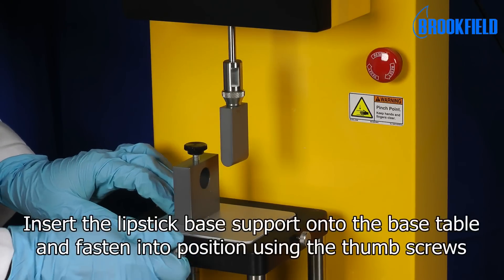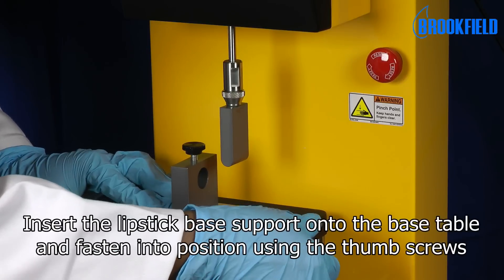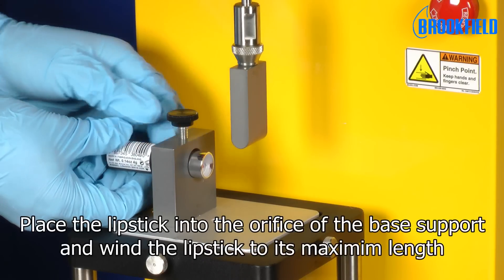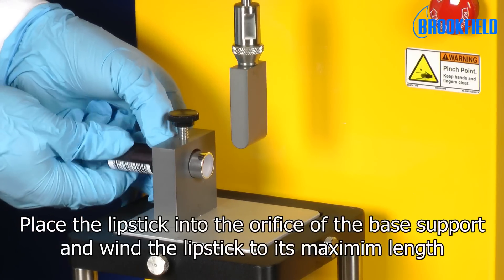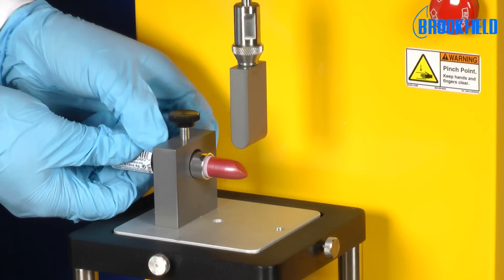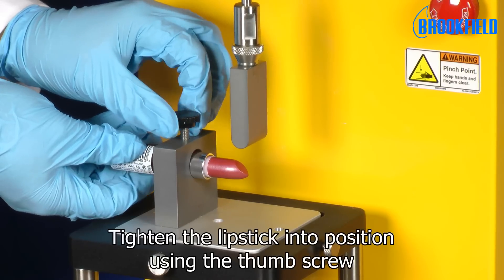Insert the lipstick base support onto the base table and fasten into position using the thumb screws. Place the lipstick into the orifice of the base support and wind the lipstick to its maximum length. We can now tighten the lipstick into position using the thumb screw.